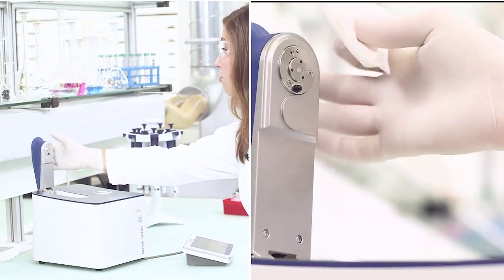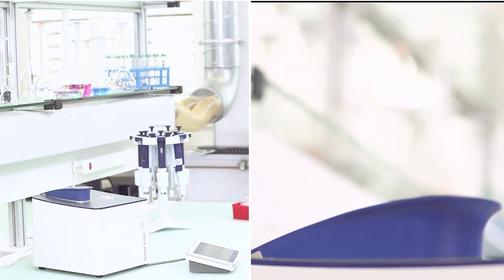The arm design is rugged and is not affected by small lab mishaps. Mettler Toledo's UV5 Nano is the ideal instrument for life science research.